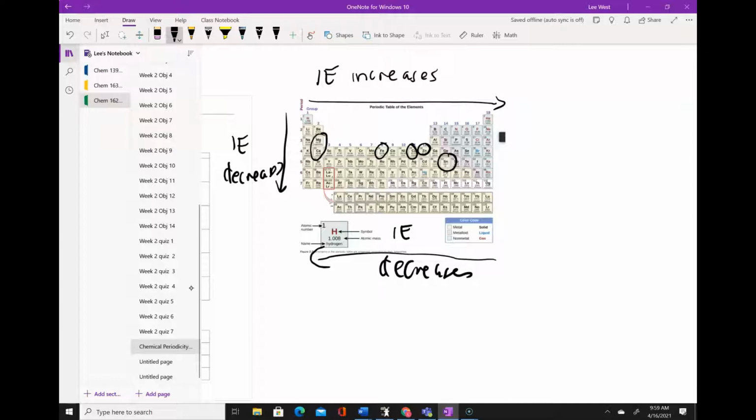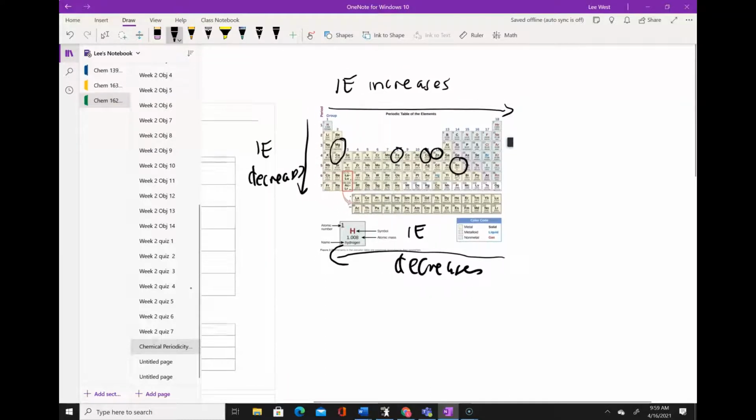And then we've got S block elements, we've got D block elements, we've got a P block element there. So maybe we can see some difference in reactivity as we move to the different regions of the periodic table. But we're also across calcium, iron, copper, zinc. We're moving across a period, aren't we? And we can have a look at how reactivity changes as we move across the period. So that'll be interesting, all right? So let's have a look at the video and see what happens.